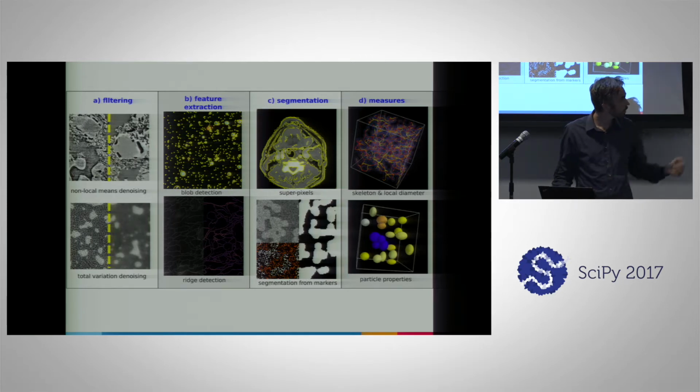Here's just a short excerpt of filtering, feature extraction, segmentation, and making measurements on objects. If you want to have a better overview of all the functionality available, please go to the website. We've got a gallery of examples that highlights almost all of the functionality inside of scikit-image.